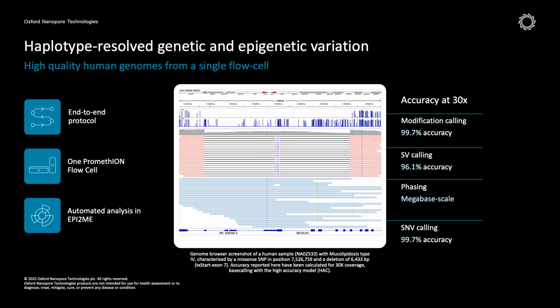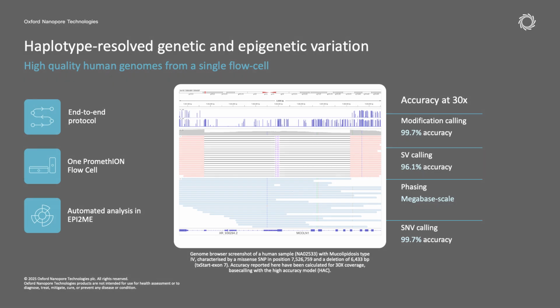So when we think about accuracy, really what I would come back to is, accuracy as Q-score is sure one way, but probably given the improvements in detection and model-based approaches, maybe not the best way to think about performance, or at least not in isolation.